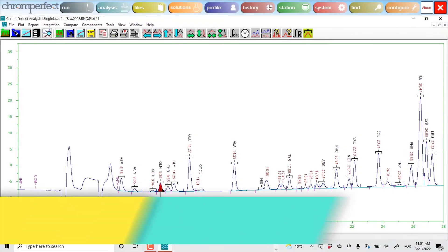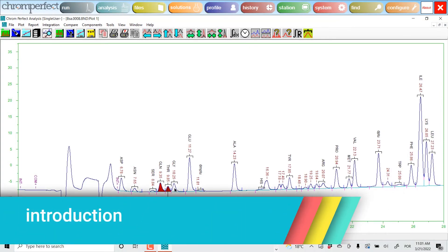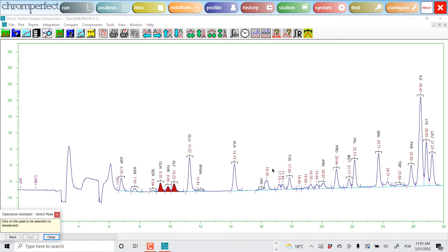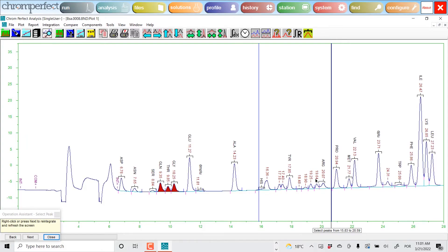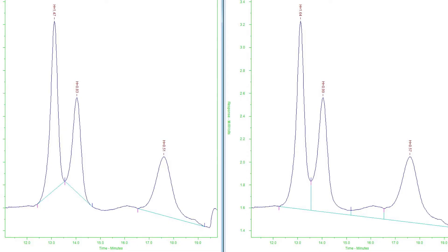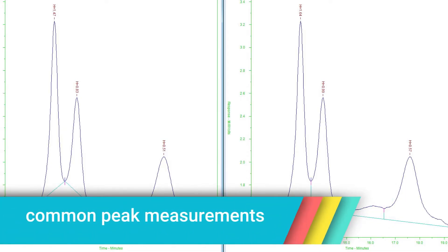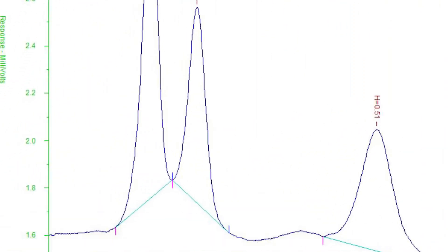Peak Theory. This chapter introduces the common measures of chromatographic peaks and defines common terms used. Here we assume that peaks have been detected and have been given satisfactory baselines. Consider the peaks shown on the screen now. The points where the baseline meets the chromatogram or the drop line define the start time and the end time of the peak.